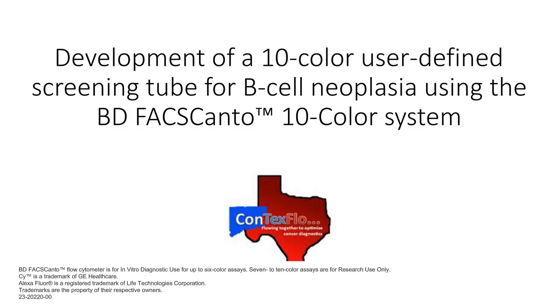Yeah, I guess I'd add that, of course, one of the Bethesda recommendations was include some very broad screen for unexpected diagnoses. So, we have lymphoma patients that come to us and they've got secondary MDS or AML, and I'd be kind of loath on a new patient to not have CD45 somewhere in your analysis. Okay, thank you.